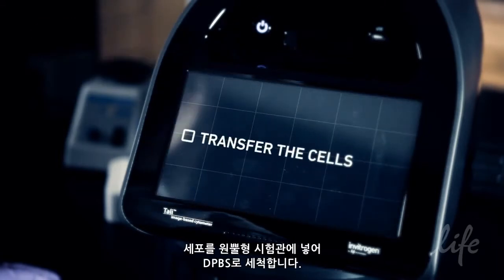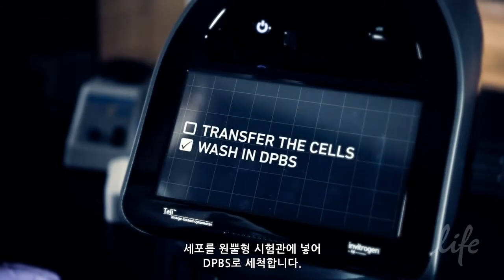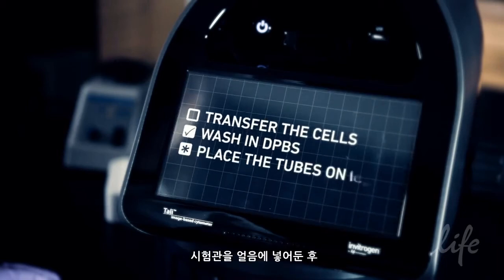Transfer the cells into conical tubes and wash them in DPBS. Place the tubes on ice.